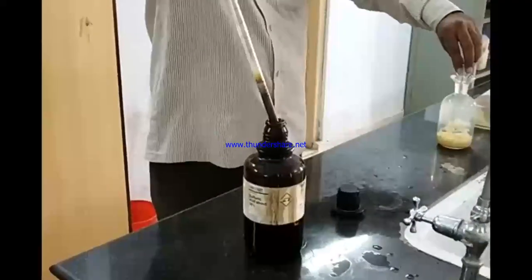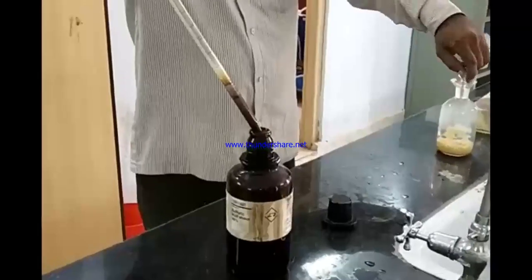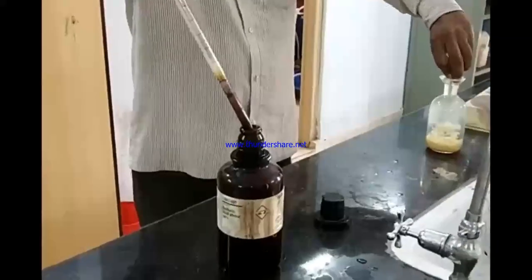You have to be very careful while adding concentrated H2SO4, because if it falls on your clothes or on your hand, it would be very dangerous. Okay, now you see, 1 milliliter of concentrated H2SO4 will be added into this BOD sample, and everything will get dissolved.